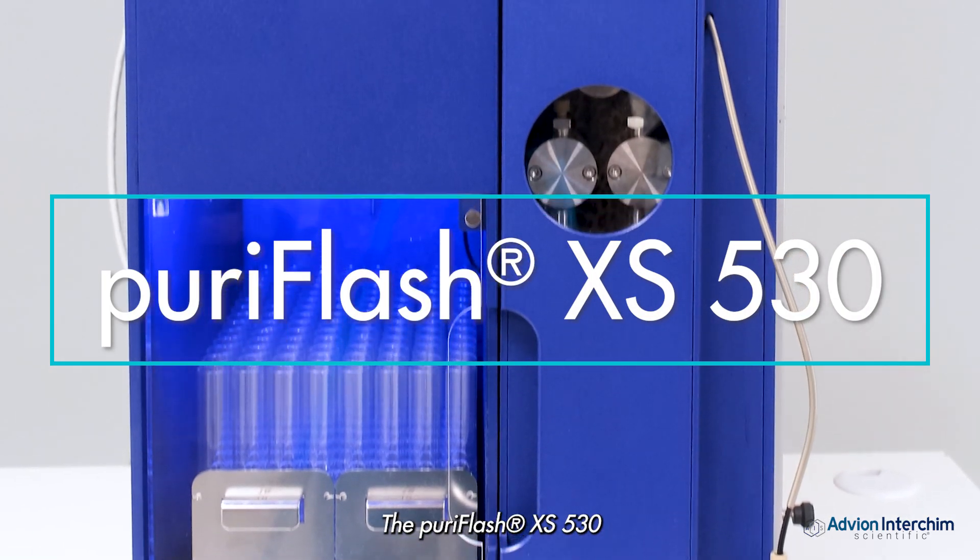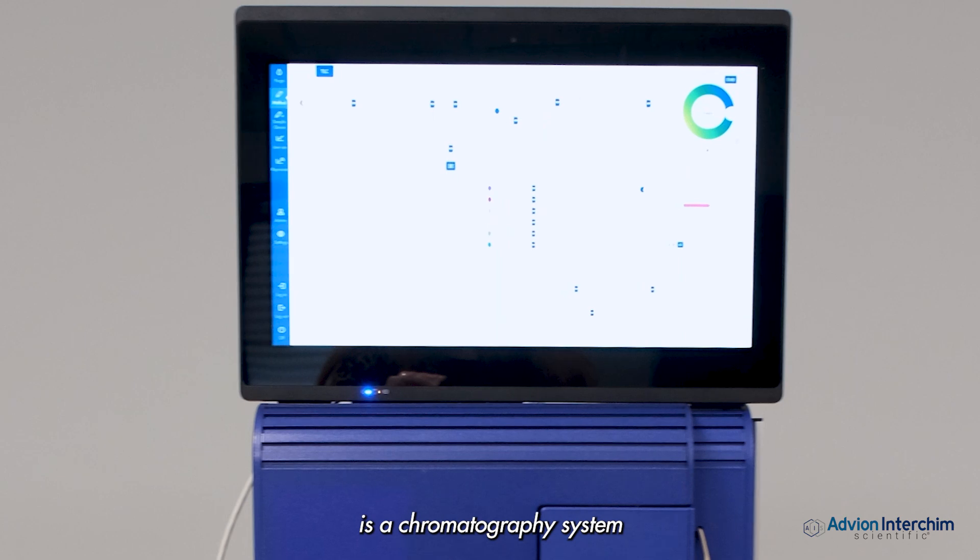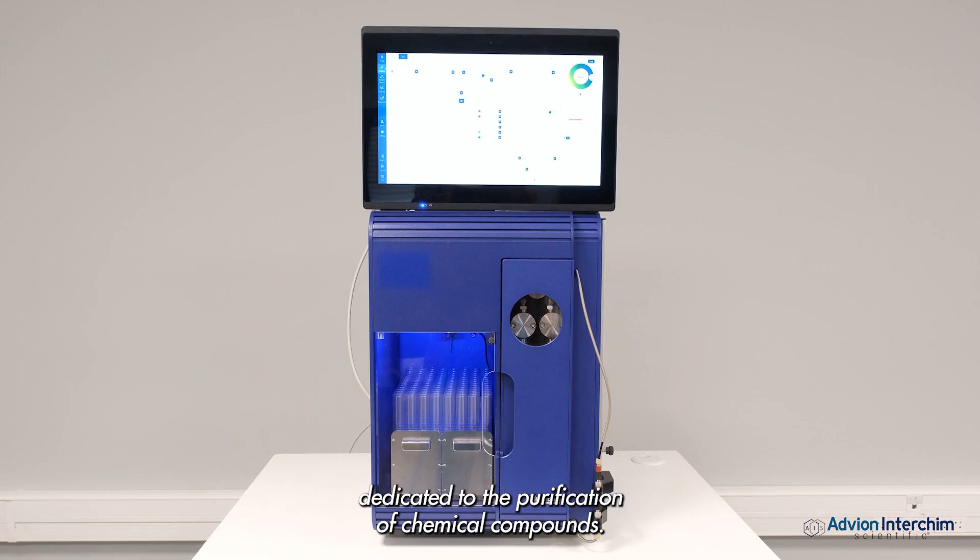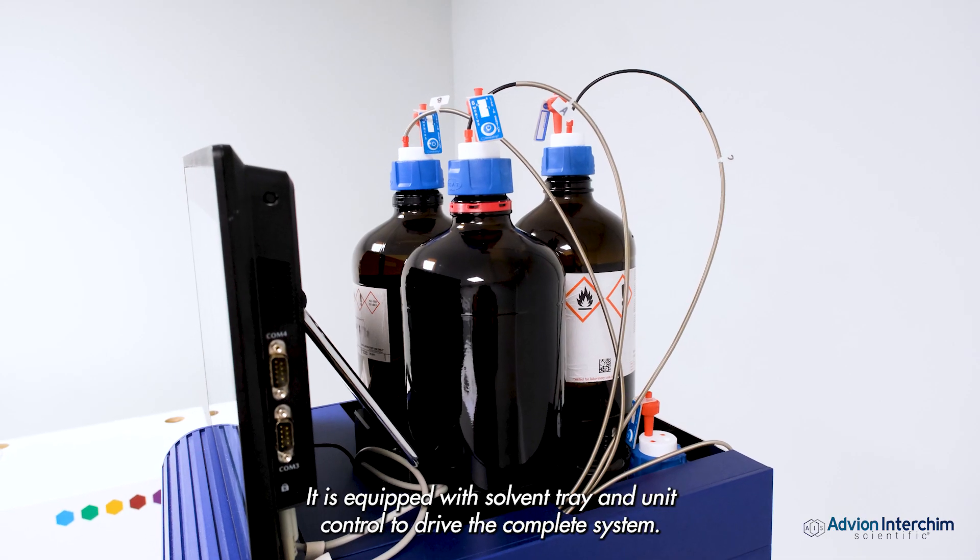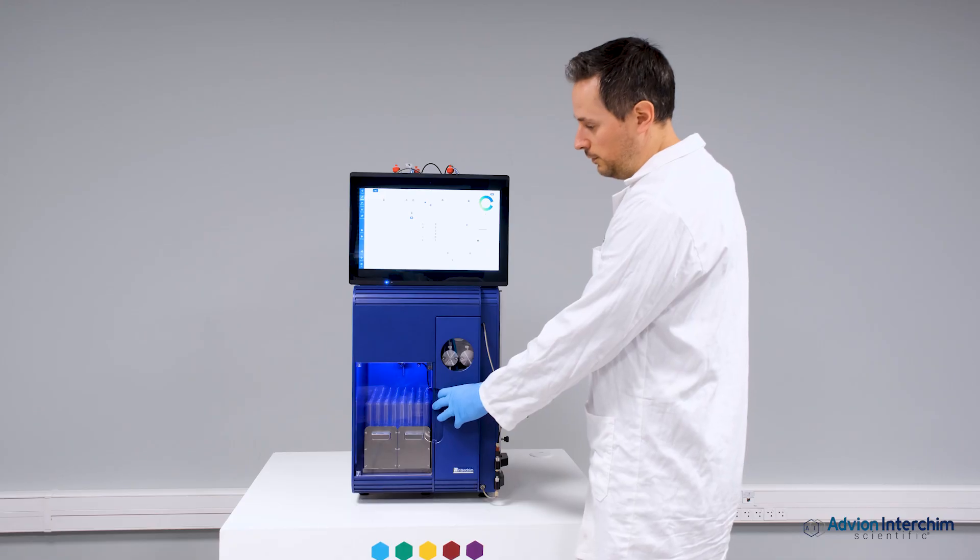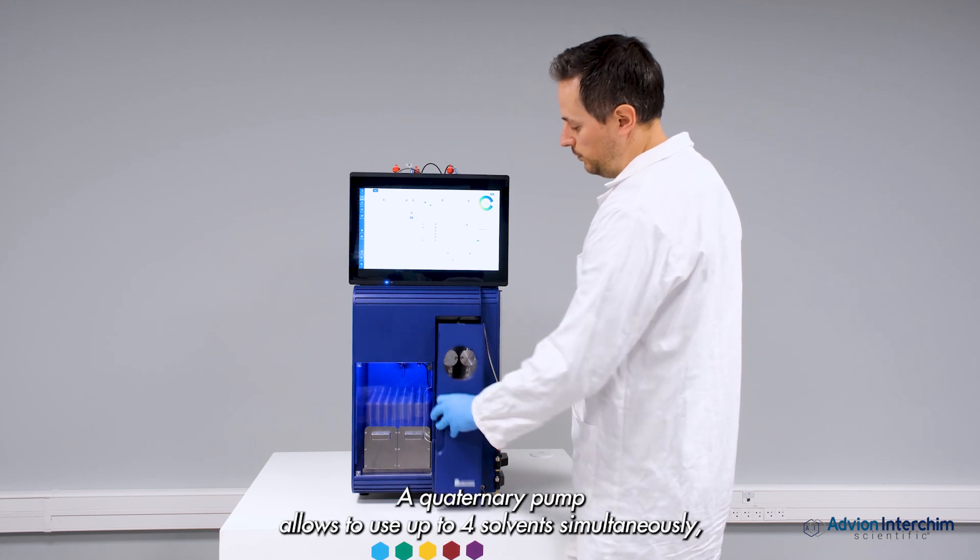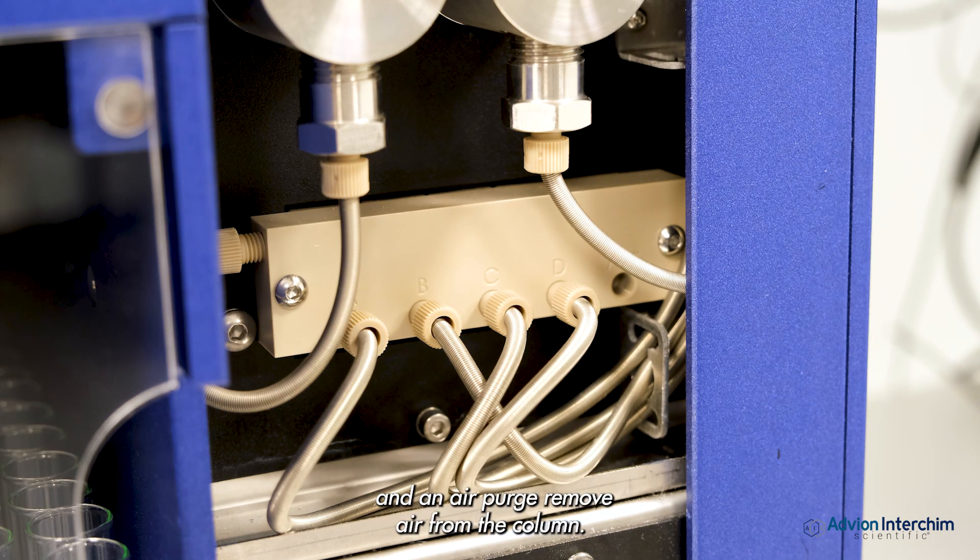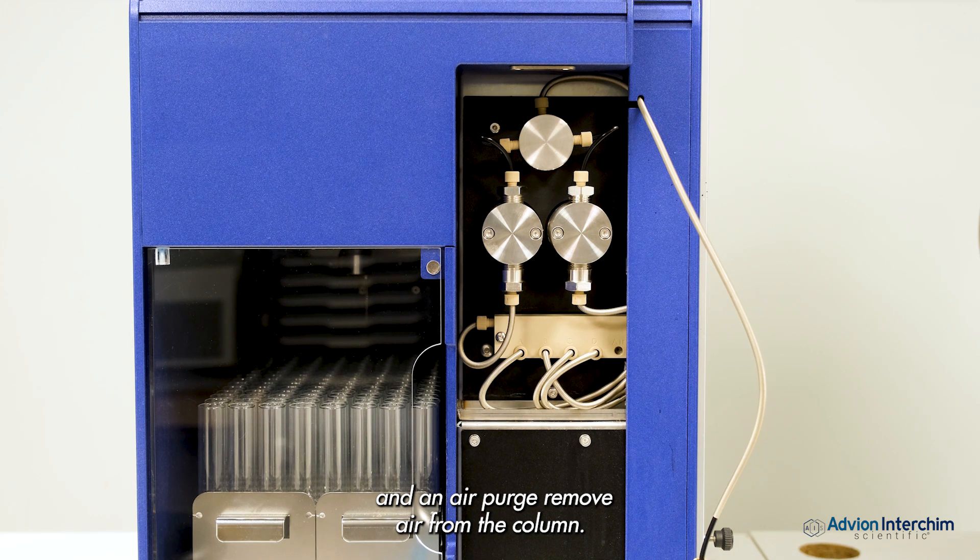The Puriflash XS530 is a chromatography system dedicated to the purification of chemical compounds. It is equipped with a solvent tray and unit control to drive the complete system. A quaternary pump allows the use of up to four solvents simultaneously, and an air purge removes air from the column.